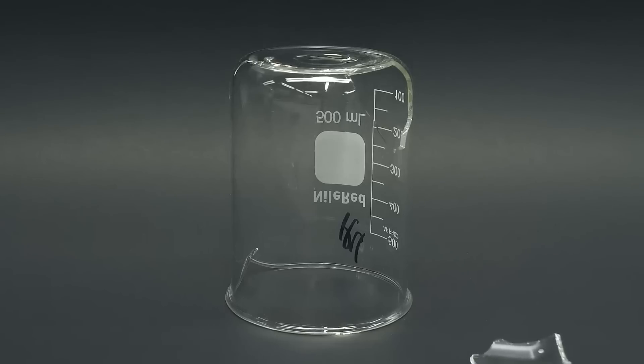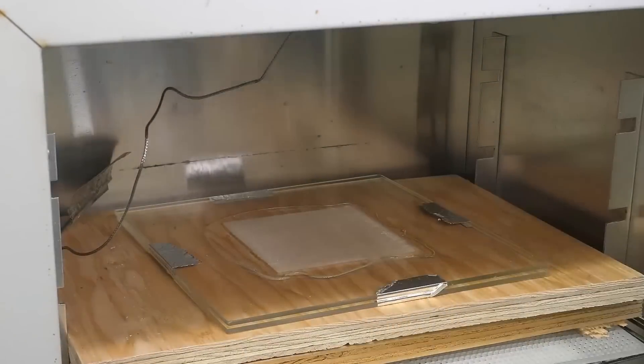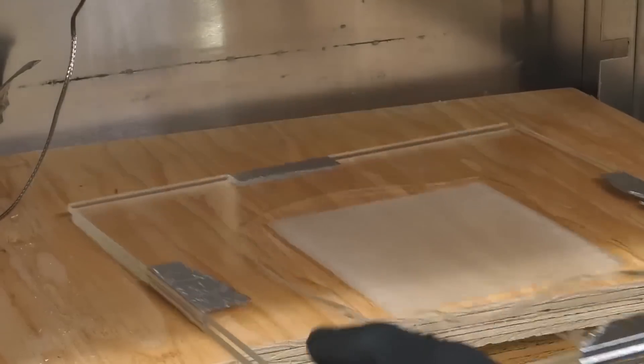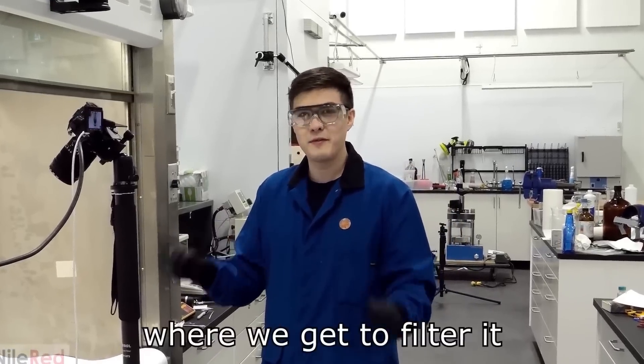This piece of glass just spit itself off. I came back to it four hours later, pulled it out of the oven, and I was kind of happy with what I saw. It's not even legally considered cheese. Shut it down. The fun part where we get to filter it.